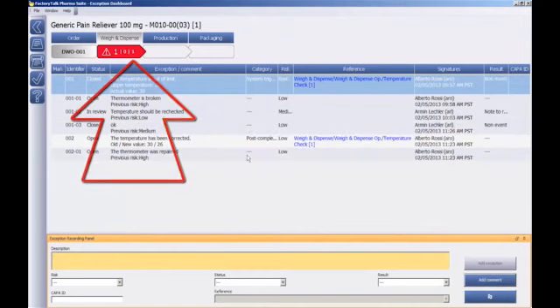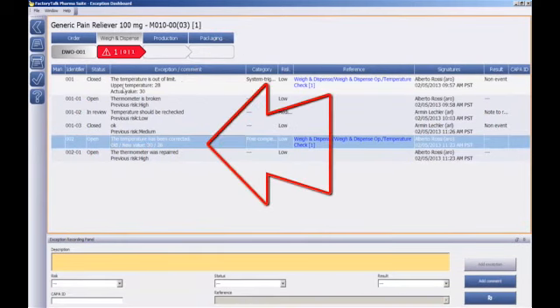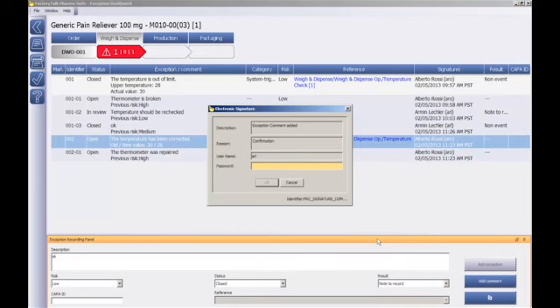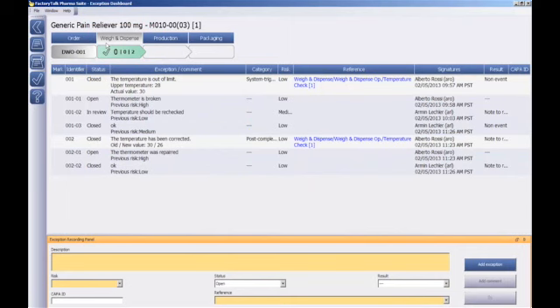The page now reflects that because the one that was in the middle has shifted to the right, representing the resolution of the exception. The only remaining exception is related to the corrected value, which is satisfactory. Set the risk to low, status closed, result note to record, and signature. The rectangle which corresponds to the weigh and dispense order step has turned green to show that all exceptions related to this case have received the appropriate response.